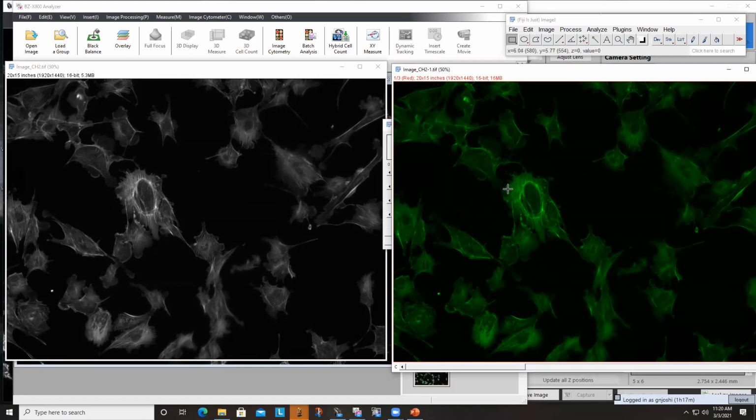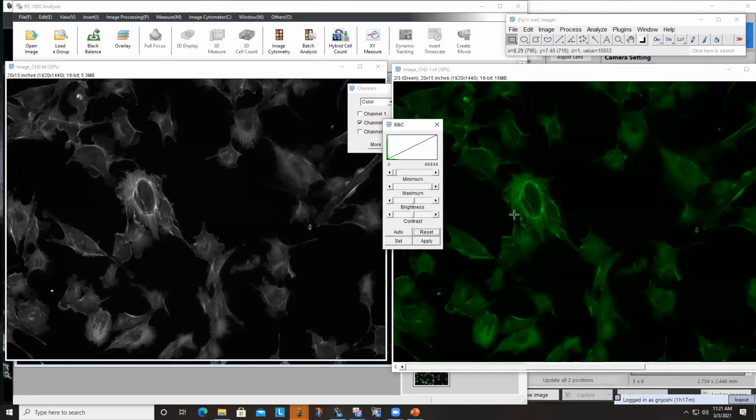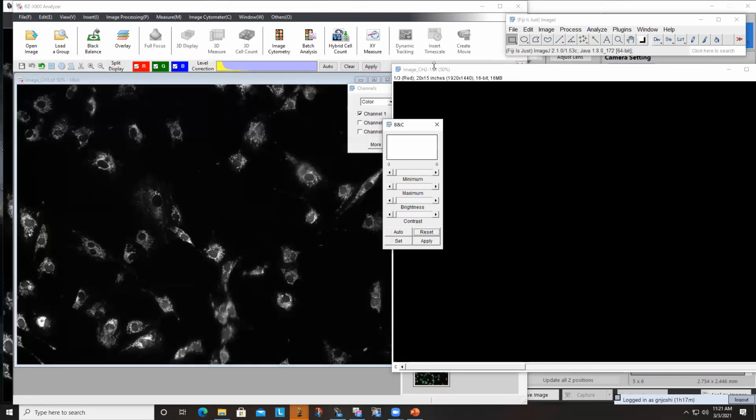So what you have to do is manually go to a channel which in fact has your color, because it's RGB, versus over here, this is exactly what you want. So that's the problem with acquiring the colored images.